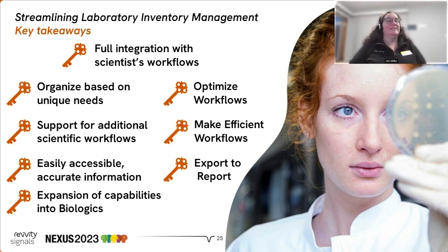All of this to say, I want to take a moment to review all of the different capabilities that we've talked about fully integrating the scientific workflow. It is absolutely imperative to making this work, making things flexible enough to meet your organization's needs and your support for scientific workflows, even ones that we aren't particularly started out in that space where we're definitely expanding as much as we can. So we want to keep data easily accessible. We want to optimize workflows, make things efficient. We want to be able to have reporting as necessary.